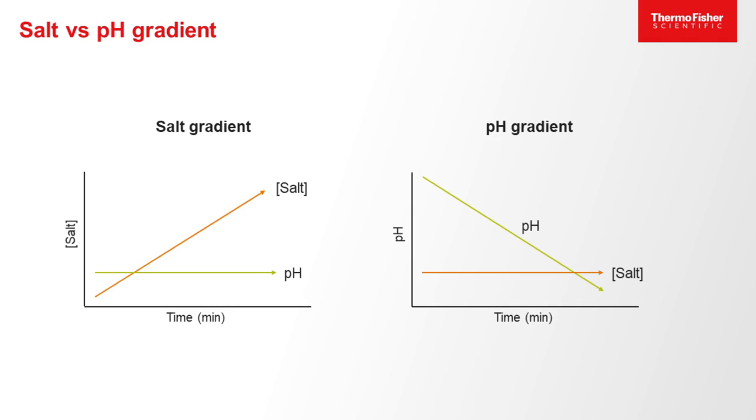With the pH gradient method, the protein is negatively charged at high pH, and in this case, AAV particles are negatively charged. And as you decrease the pH, the AAV particles become neutral at their PI value and elute from the column. There is a small difference between the PI of full and empty particles, which allows this separation.